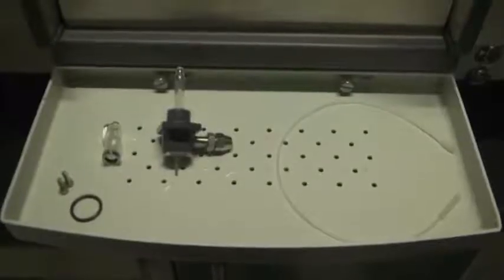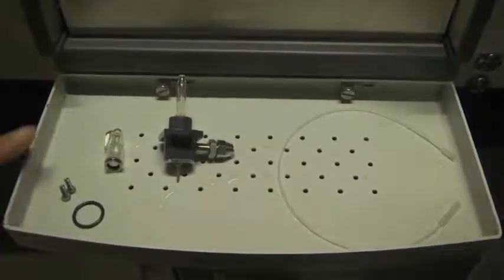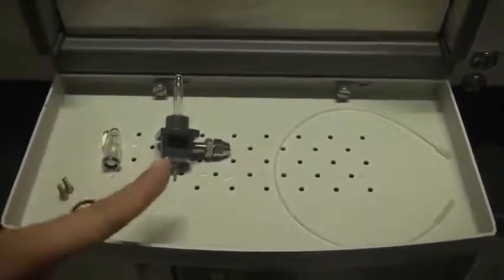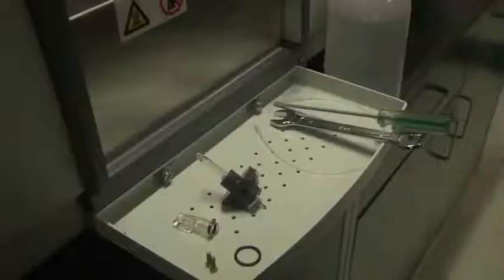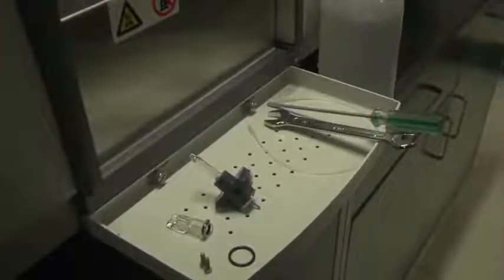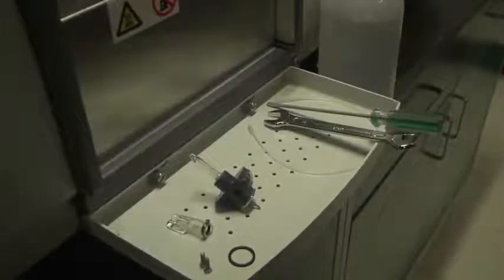Take the nebulizer out of the box. It comes with one O-ring, two screws, one head, the nebulizer body, and one capillary. Also prepare a spanner, a screwdriver, and a bottle of DI water for the installation of the nebulizer.